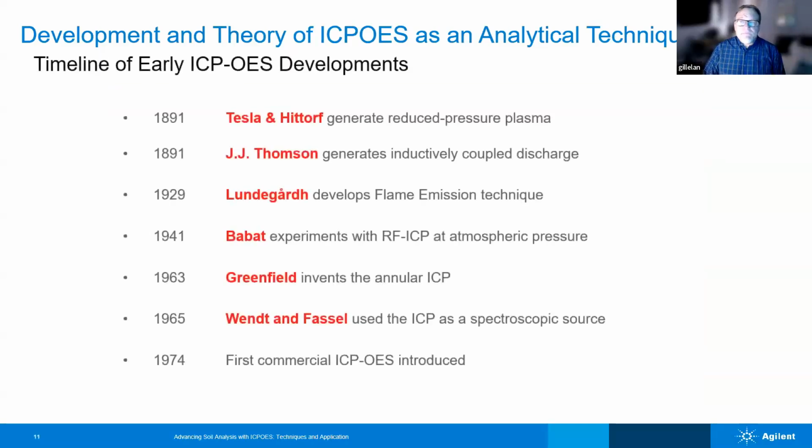In terms of the ICP being developed, it was really the plasma that was developed, because they hadn't thought of it as an analytical tool quite yet.